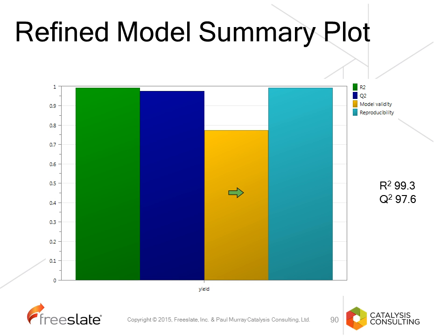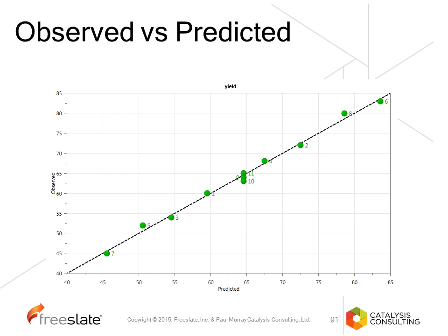We look at this to see how well this would predict our results, and you can see very, very well that all of the results are sitting on this line of the plot of observed versus predicted results. What this tells us is the model predicts very accurately the results that we see.